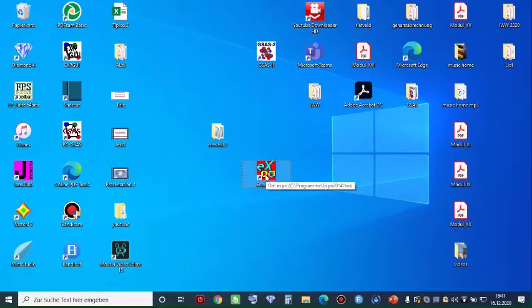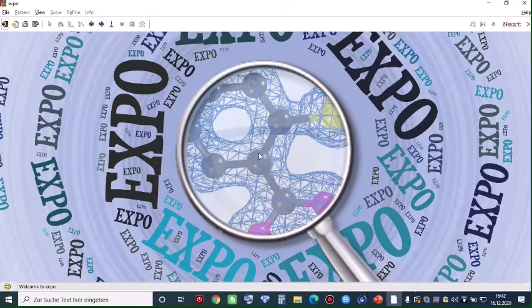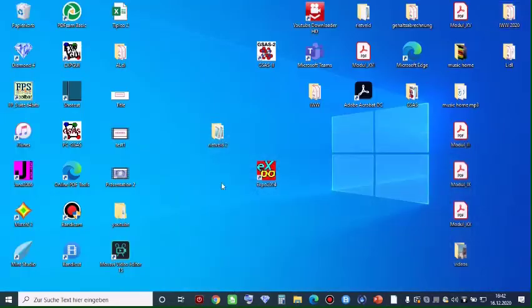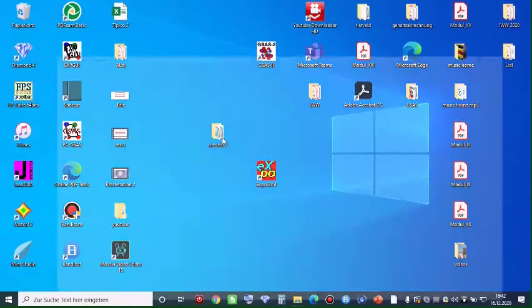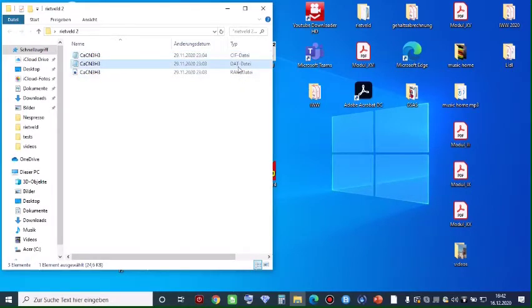First of all, open the software Expo on the desktop as shown. You have to have two pieces of data which are very important. I have prepared this for you: the CIF file, and the DAT data, which is the powder X-ray data you need for the refinement.